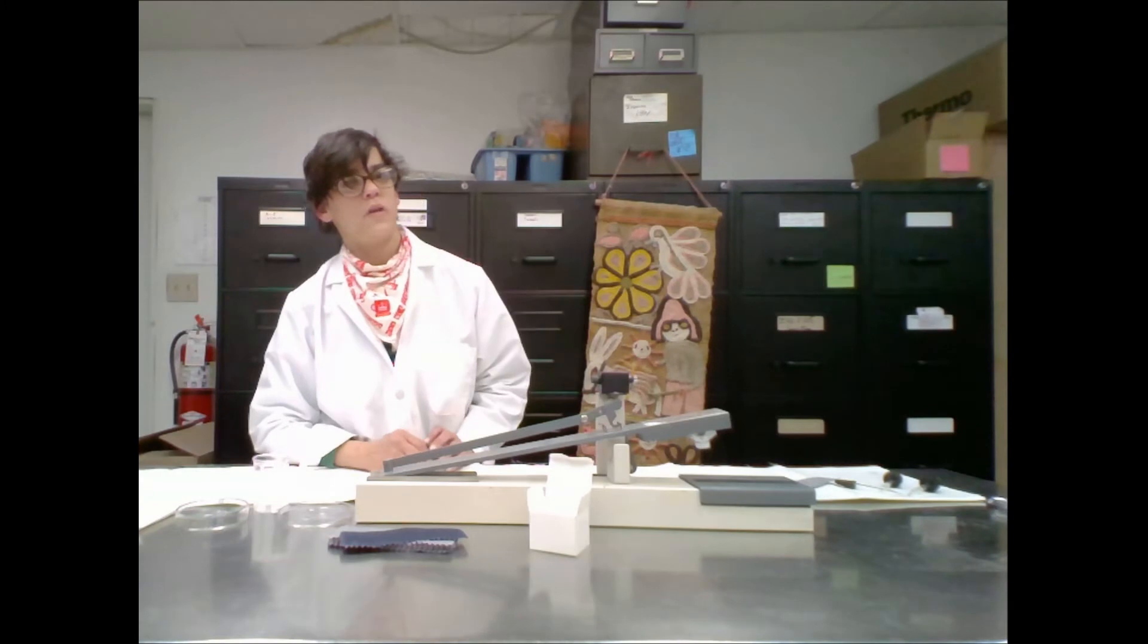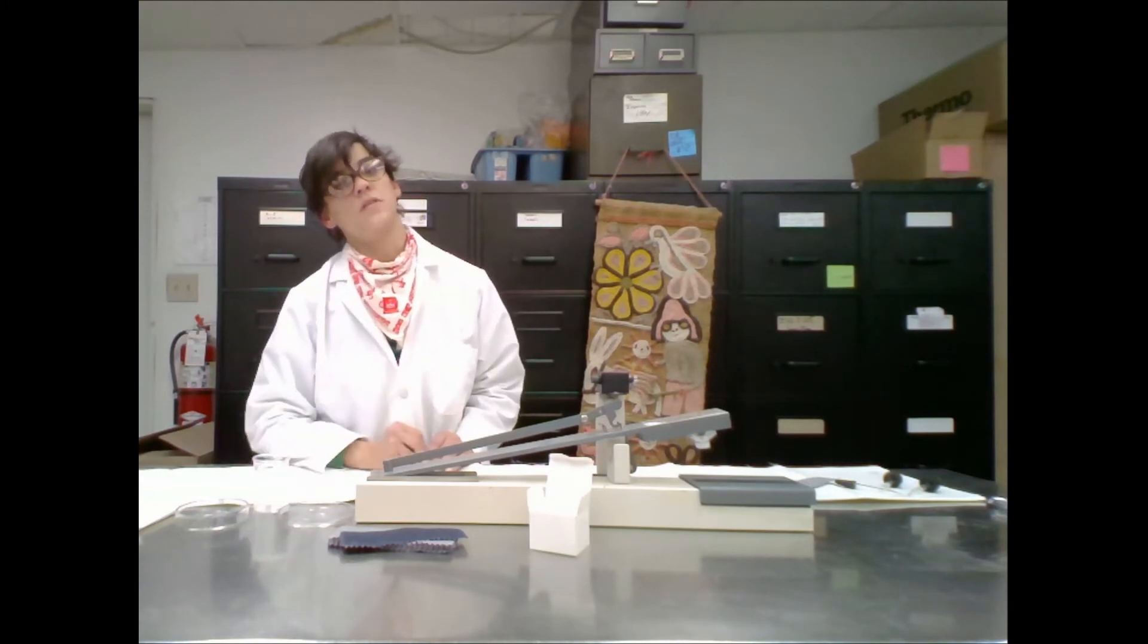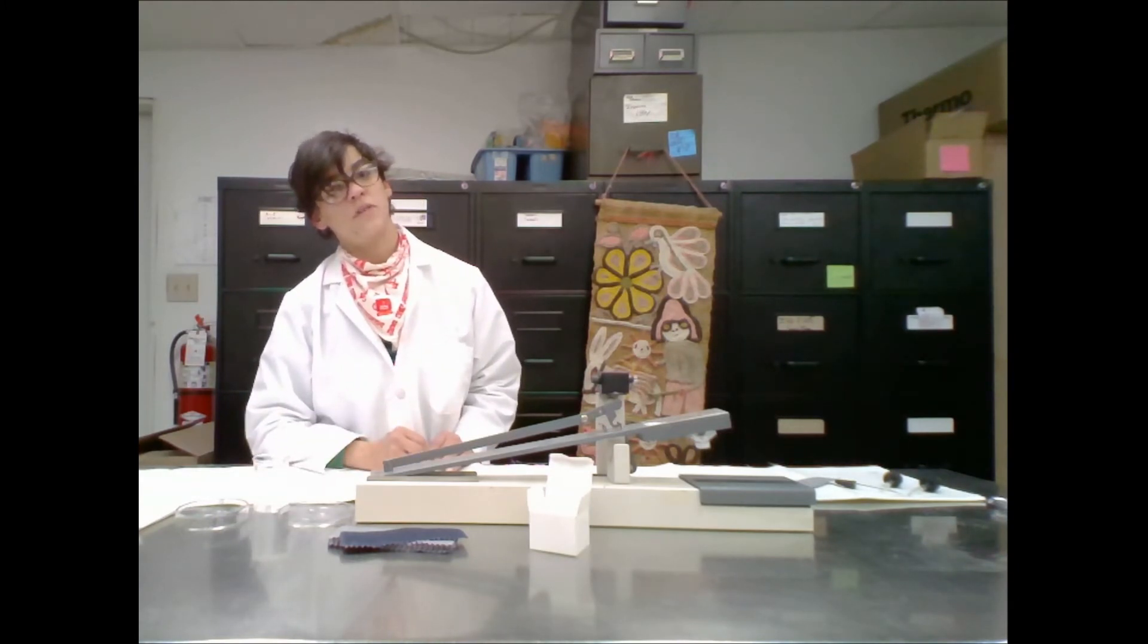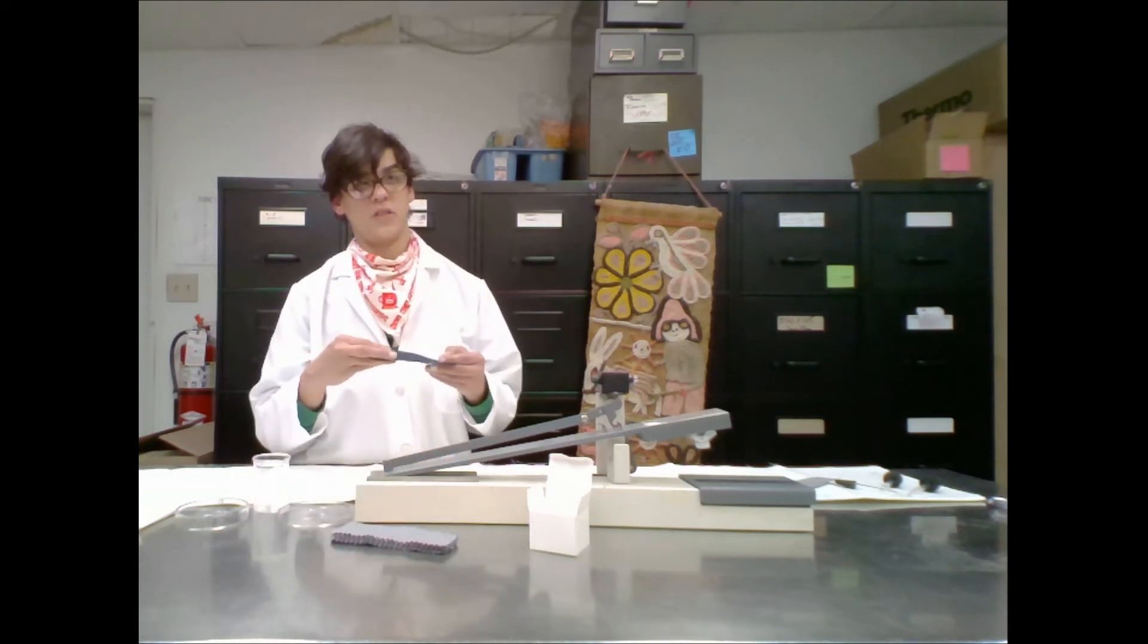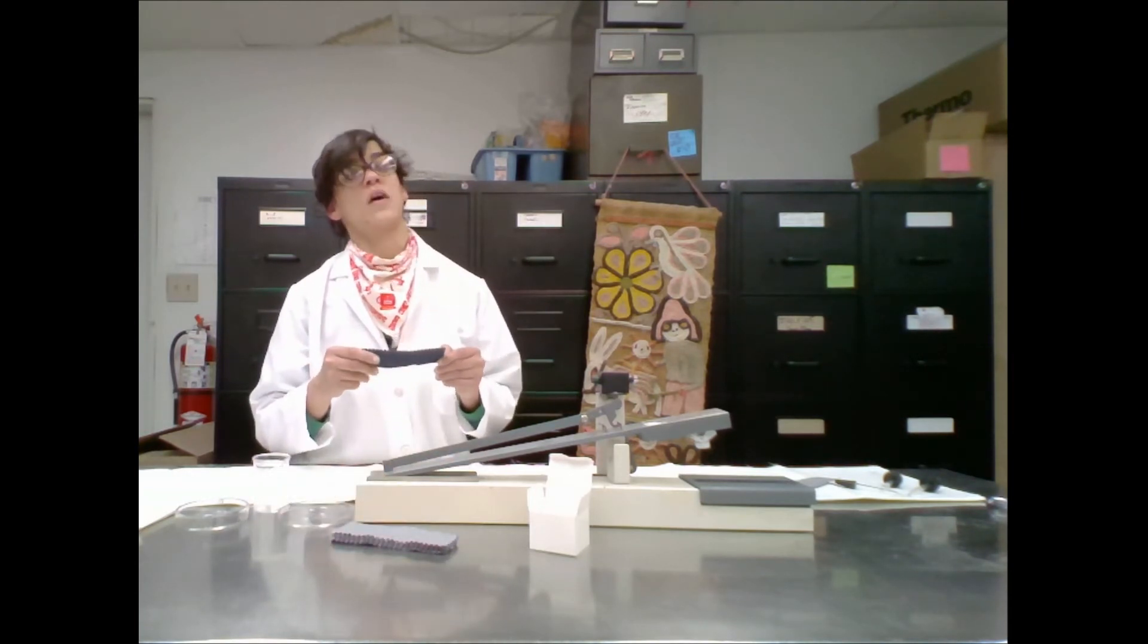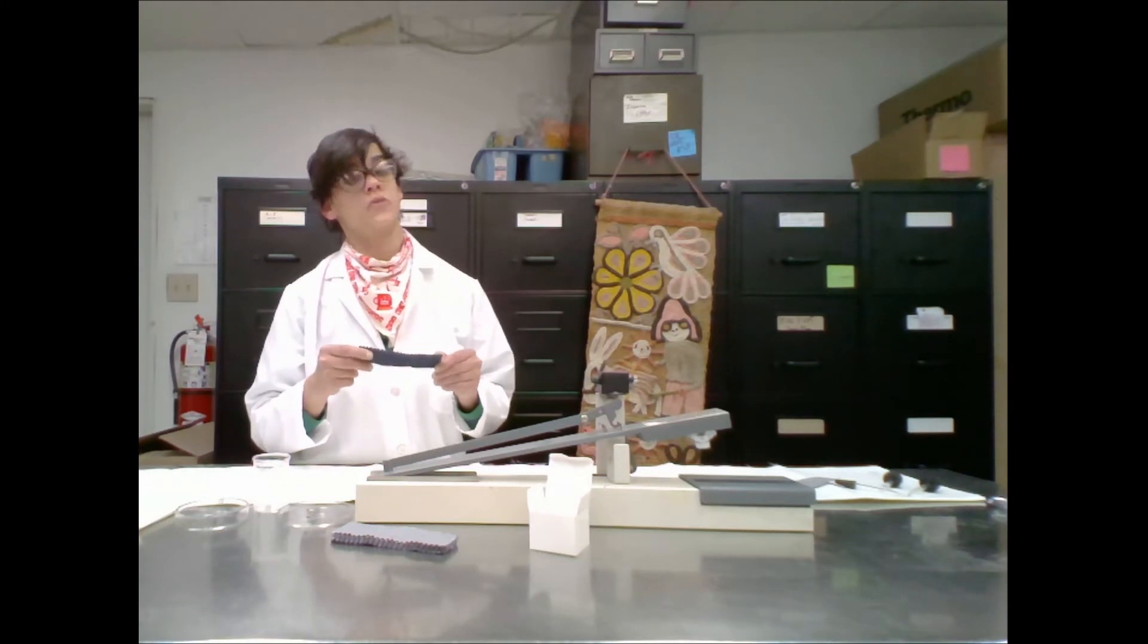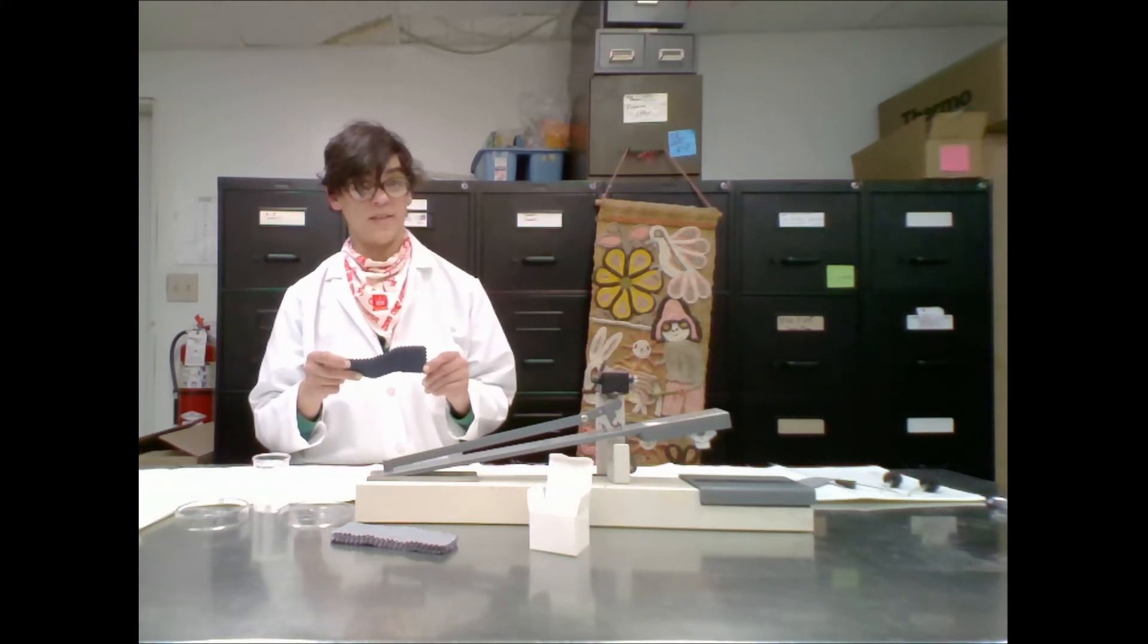To do the Croc Meter test, cut two specimens of the backing fabric to be tested. Cut them two inches by five inches on the bias so that both warp and weft yarns are tested for color fastness evenly.